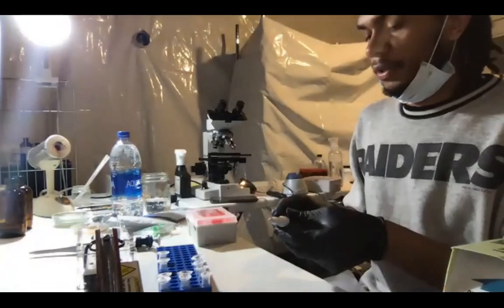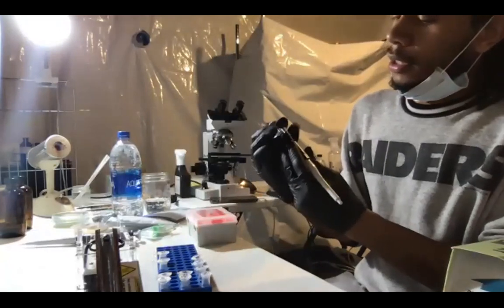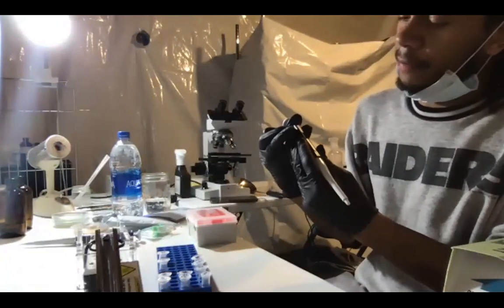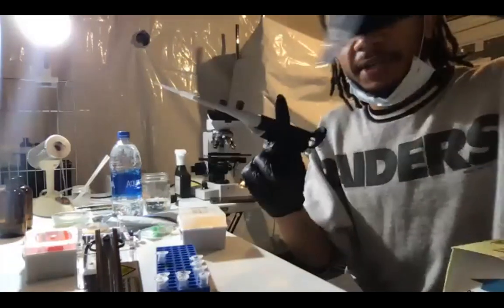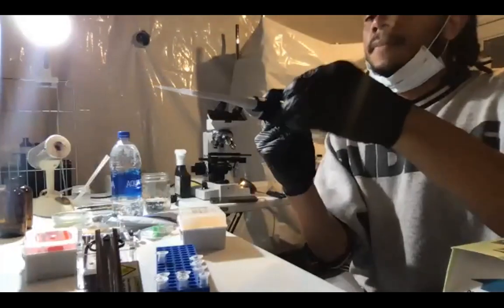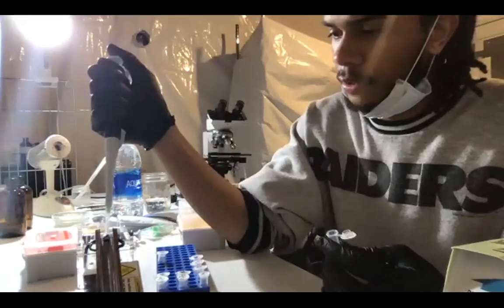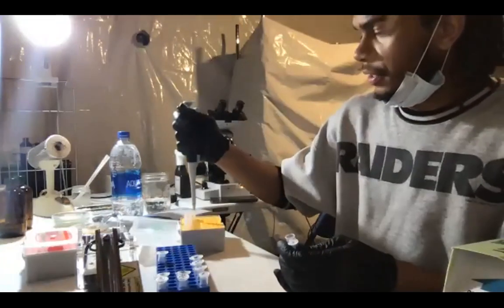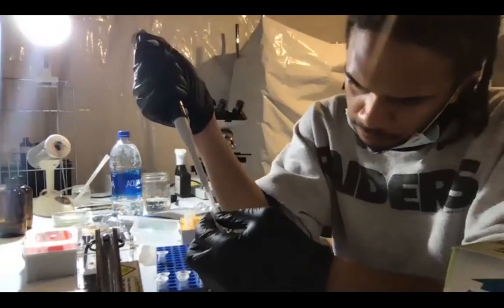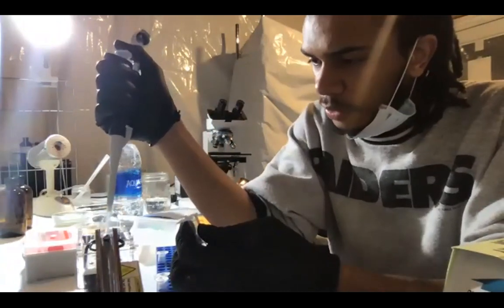All right, so I set this up for a 25 microliter reaction. So what I'm gonna do is change the bigger pipette to 25, and use the big pipette tips. And then I'll take my number 1 mix with master mix and MAT1 primers. And I'll take 25 and put it in the first 4. So 25 goes into number 1. Eject after each one if you stick it in the tube. You don't necessarily need to stick it in the tube, but I did it by accident with that one. If you hover it above the tube, you don't need to. You don't need to change the tips, but it's really hard with these small ones. So I'm just gonna do that.